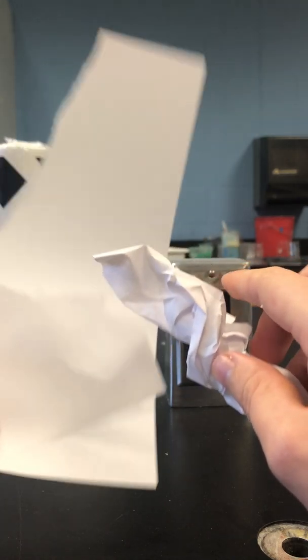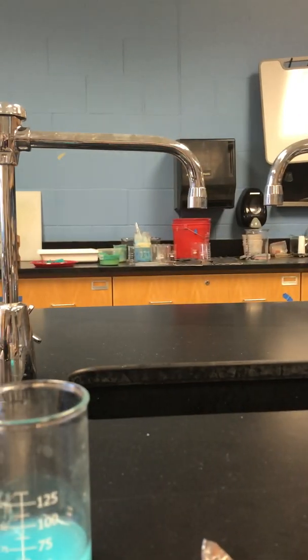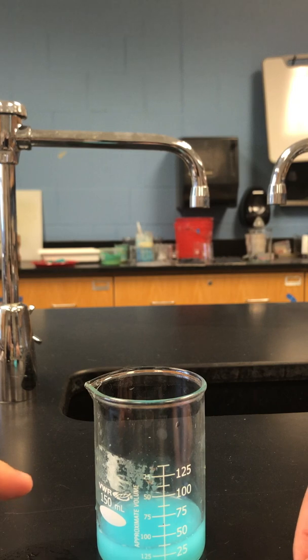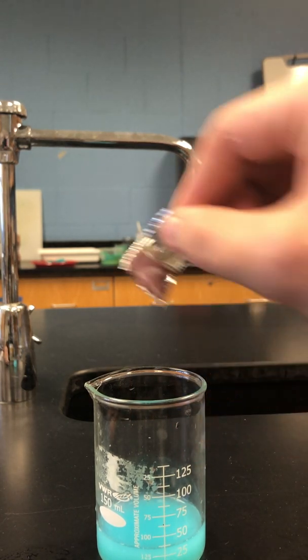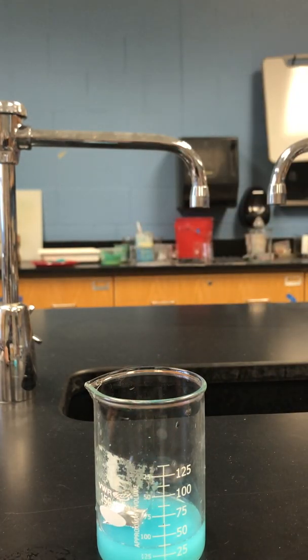So what about some chemical changes? This liquid right here is called copper chloride. Copper chloride is a very fancy kind of salt. This is aluminum foil, like what you would get at a grocery store. What I'm going to do is put the aluminum foil into the copper chloride.